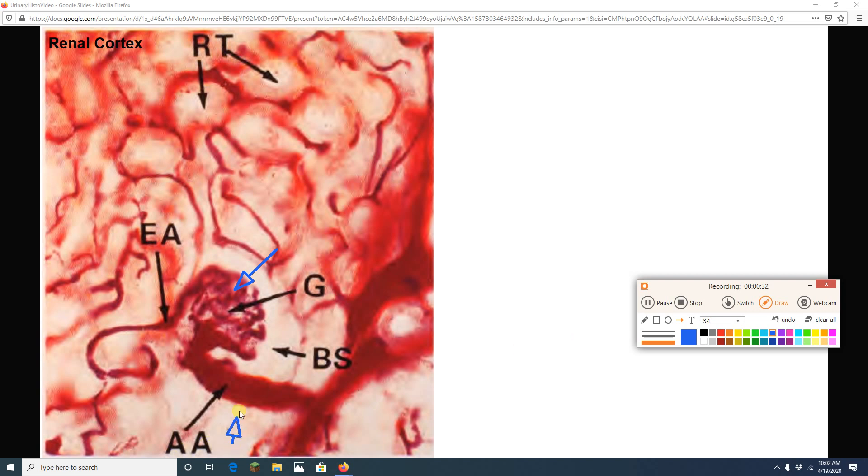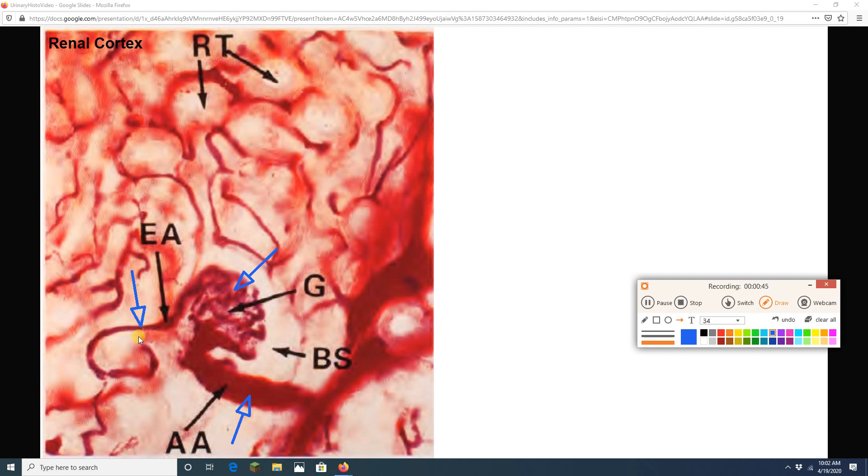I can see my afferent arteriole bringing blood to that glomerulus and my efferent arteriole taking blood away. Notice the immense size difference between the afferent and efferent arteriole. This is going to increase pressure in the glomerulus, and that pressure is going to drive filtration.